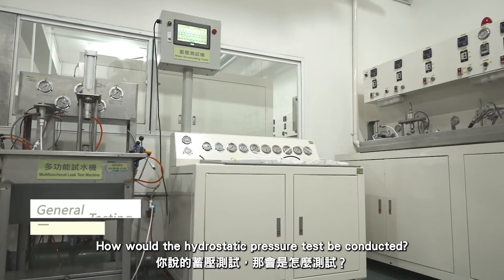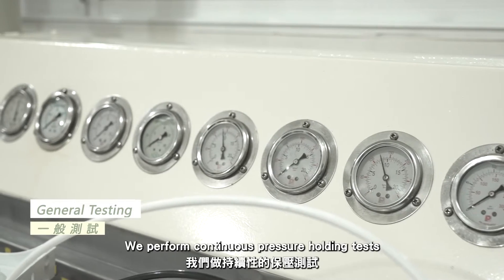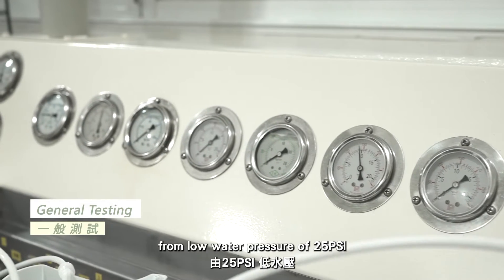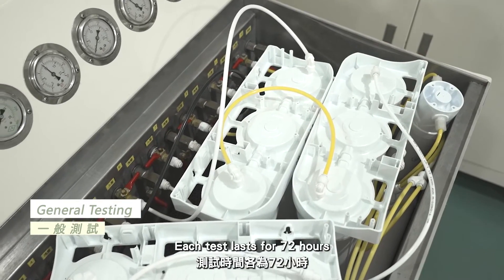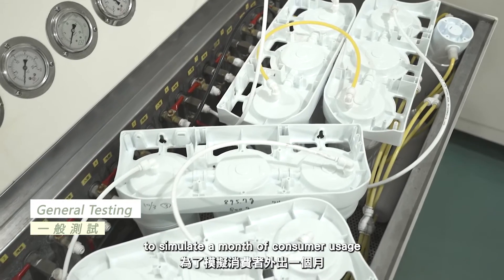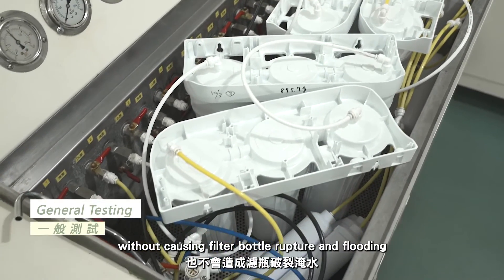How would the hydrostatic pressure test be conducted? We perform a continuous pressure holding test from low water pressure of 25 psi to high water pressure of 150 psi. Each test lasts for 72 hours to simulate consumer usage without causing filter bottle rupture and flooding.